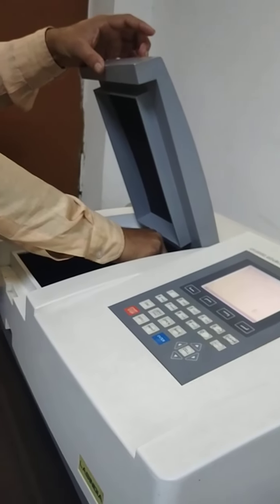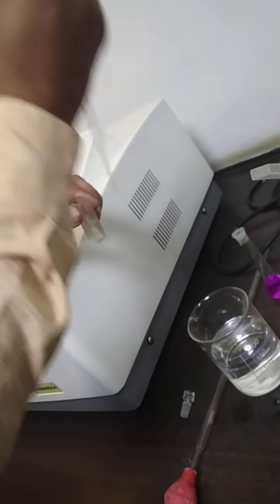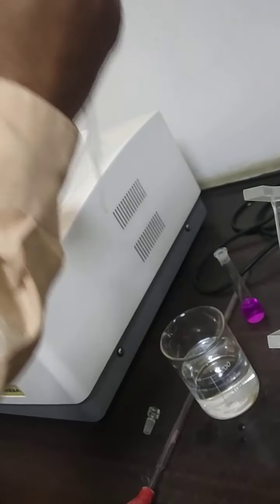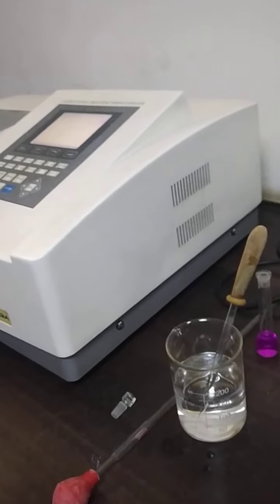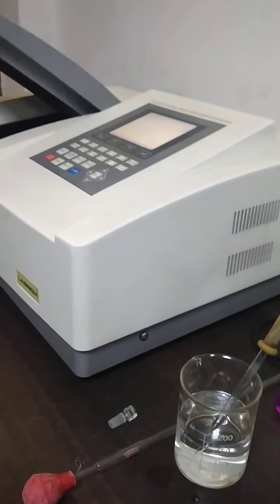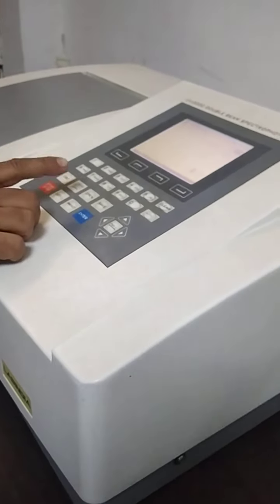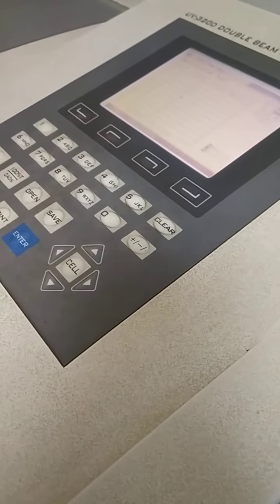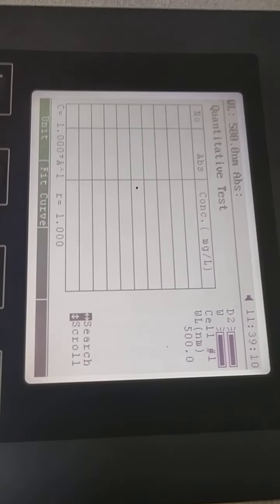After performing blanking, use your blank solution. After putting your blanking cuvette, fold it off and start putting the 0%. The blanking will show up here. If you want to read out your blank readings, go to the start button.